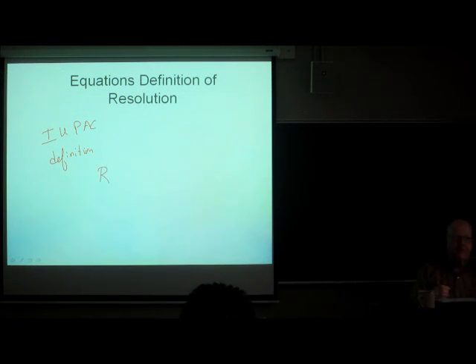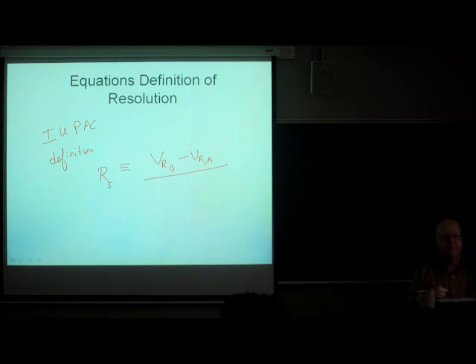But resolution, which is written either as a capital R and also as R with a subscript S, is defined as the difference in the retention property of the better retained peak minus the lesser retained peak.